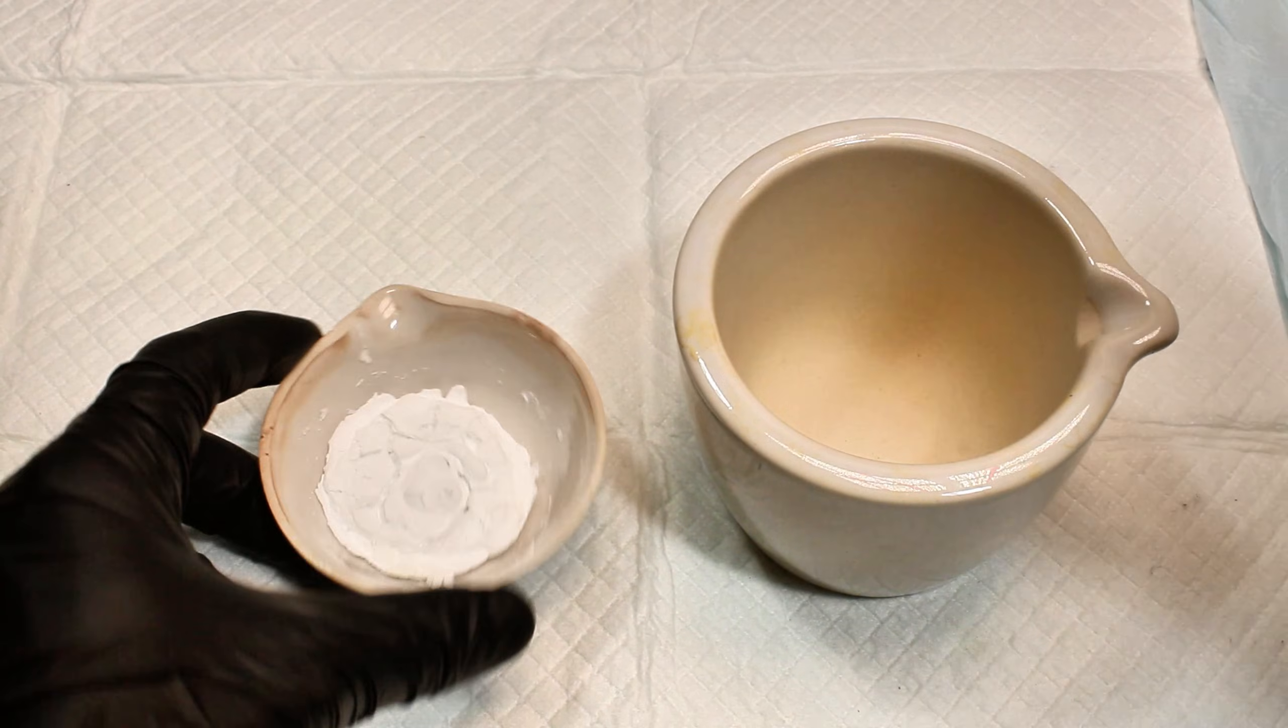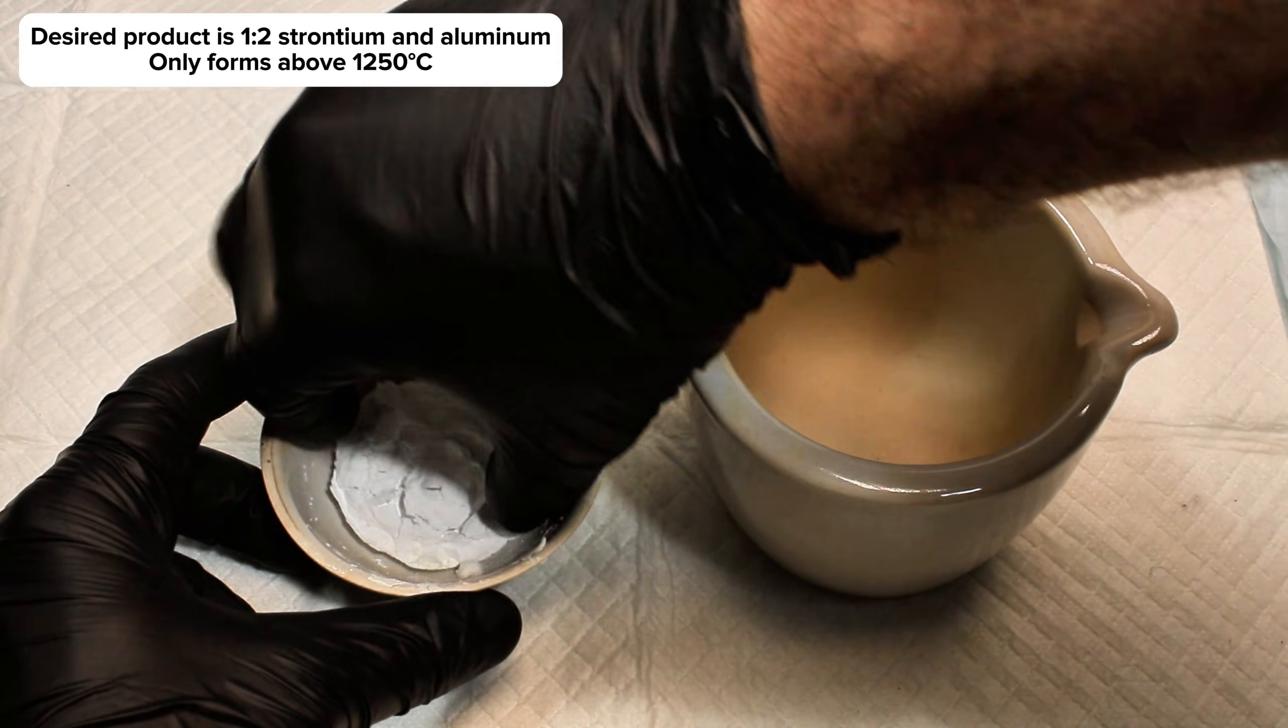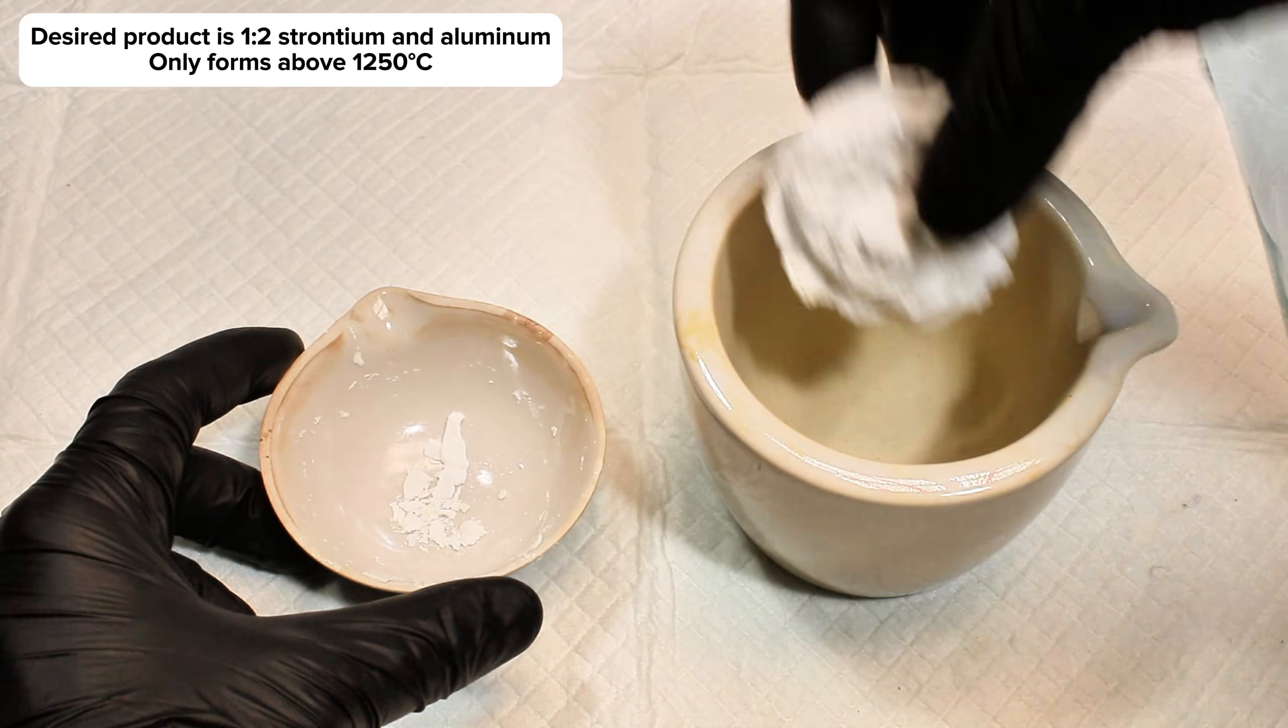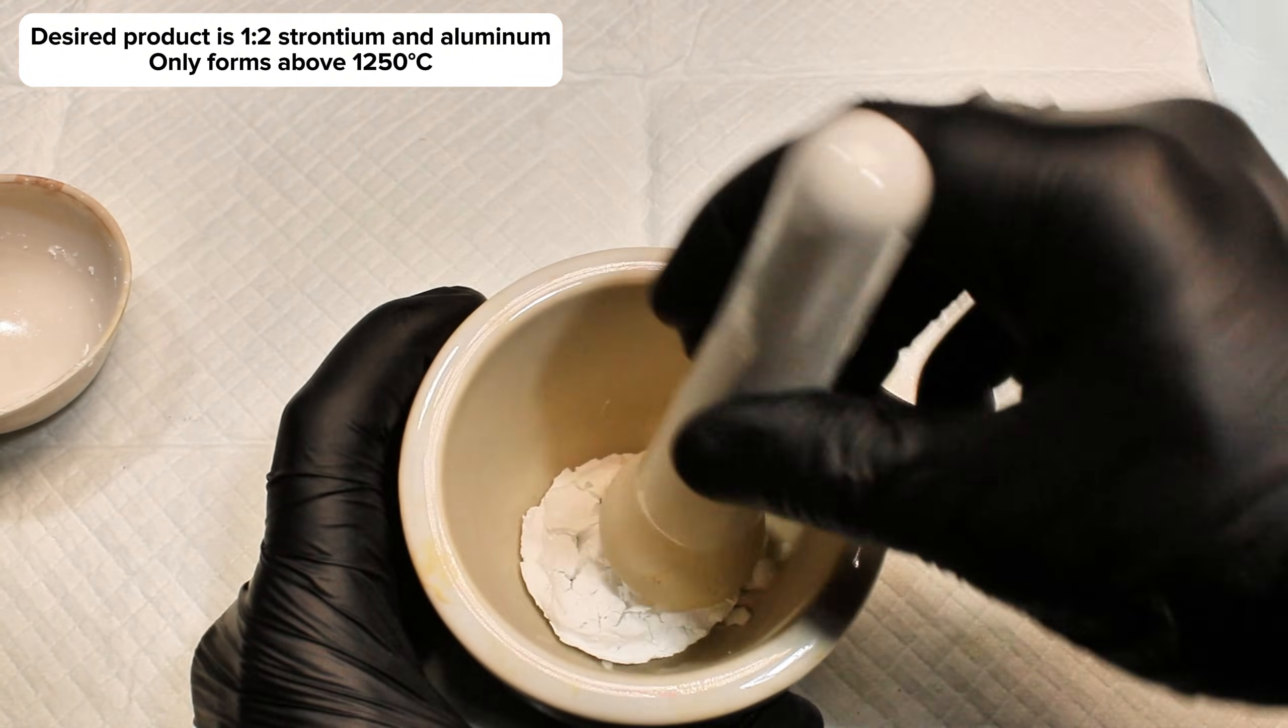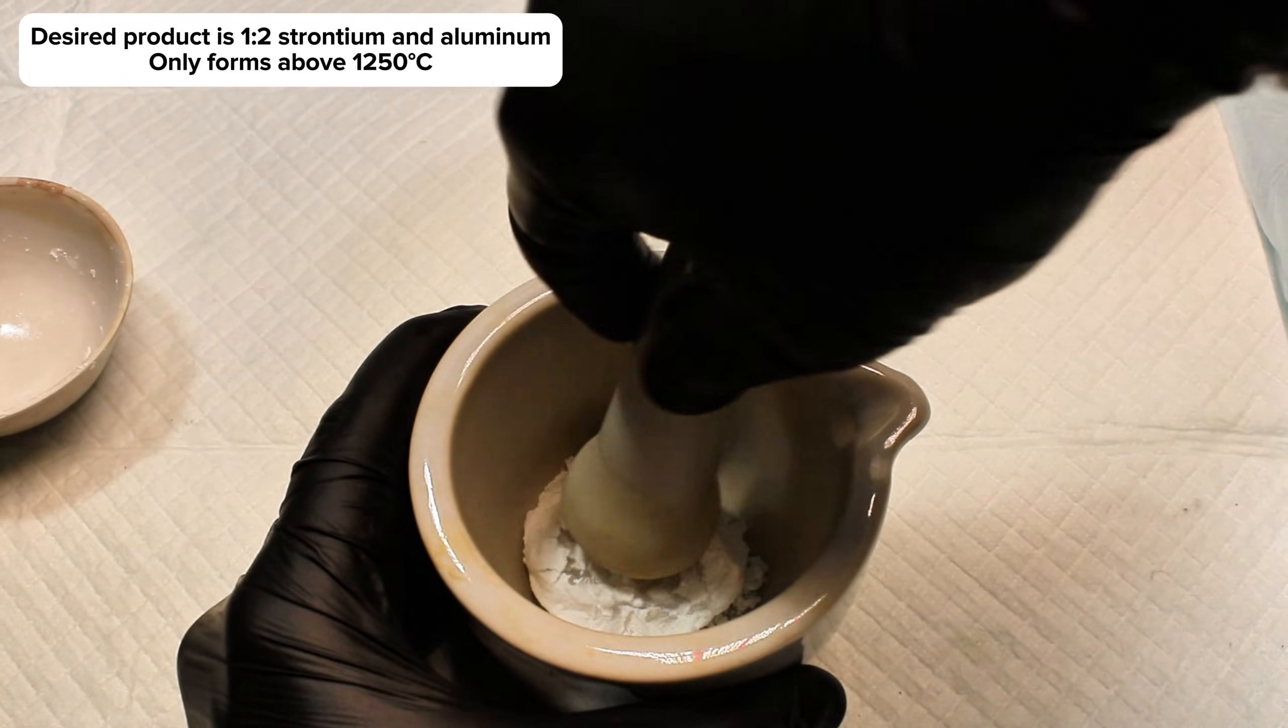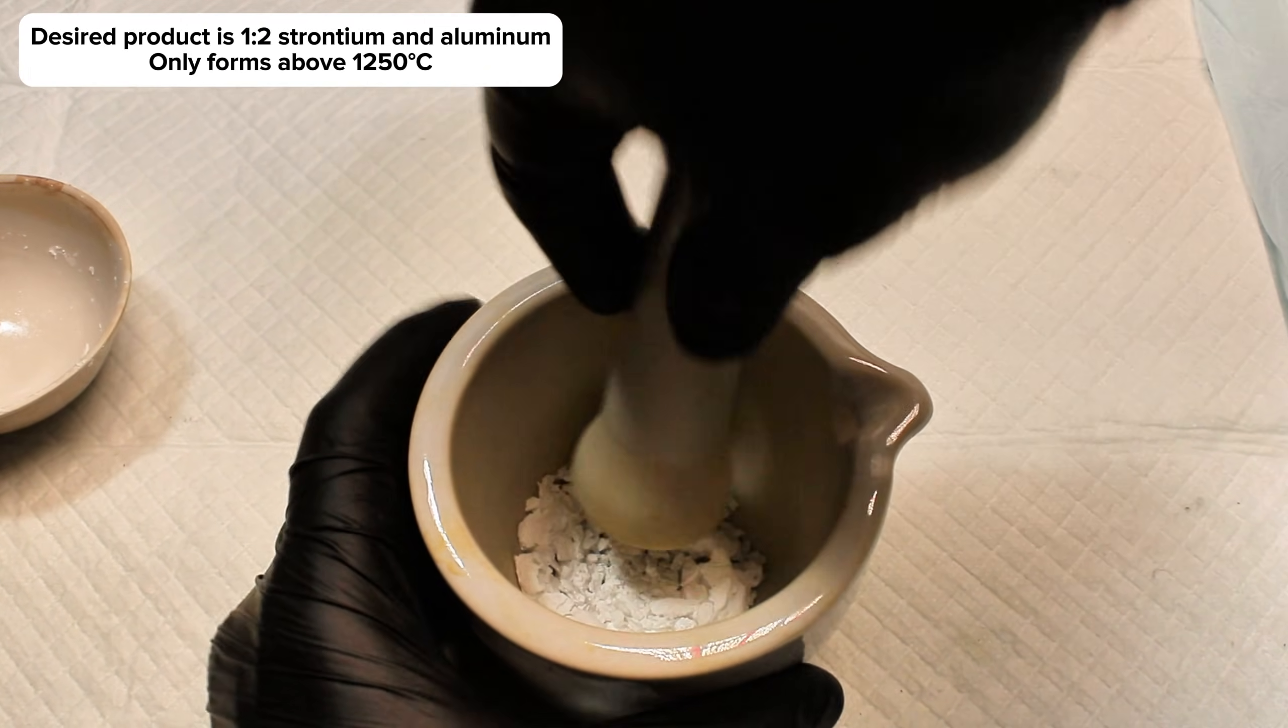Simply doing it this way as I had been results in the formation of inconsistent strontium aluminates with a variety of empirical formulas. These will still glow to varying degrees and intensities, but to produce the 1 to 2 desired ratio of strontium and aluminum, the mixture must be heated to at least 1250 to 1500 degrees Celsius, which my poor kiln was clearly not able to reach in a mere 15 minutes.